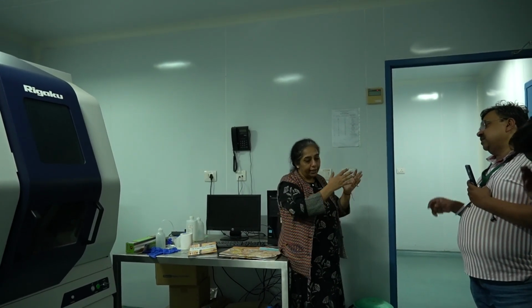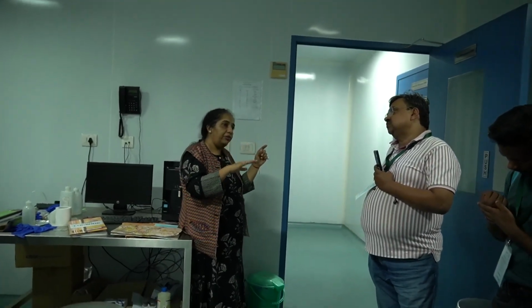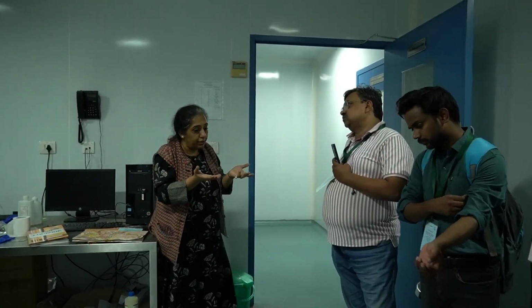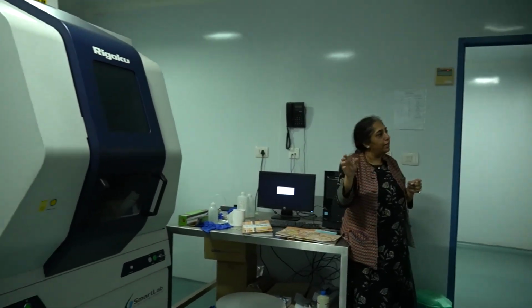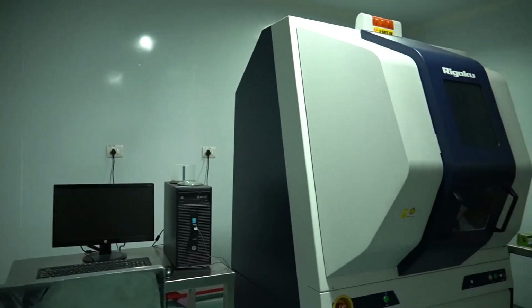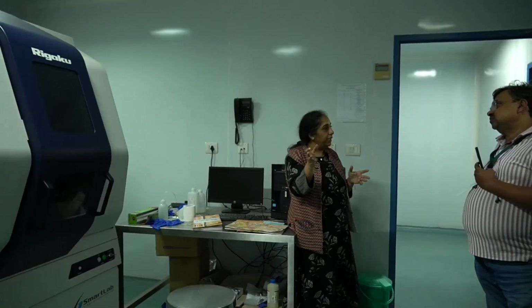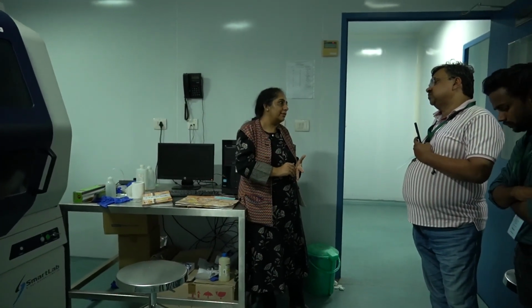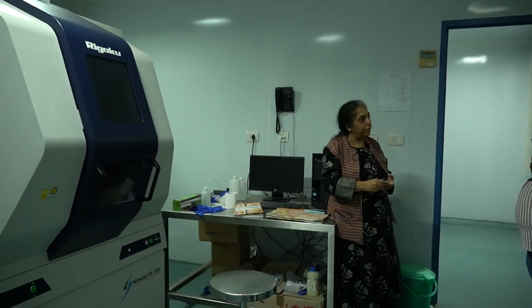Yes, because in X-ray diffraction we get a graph between 2 theta on the x-axis and intensity on the y-axis. Different planes have different intensity. That represents whether the given material is in the form of sheets or hexagonal, and the growth will be along that particular plane. There is the concept of Miller indices, like 1 0 0, 0 1 1. We assign these planes to the XRD peaks, and on the basis of 3 factors, intensity, FWHM and position, we are able to assign the JCPDS file and accordingly name the phase, like titanium oxide has different phases such as rutile.